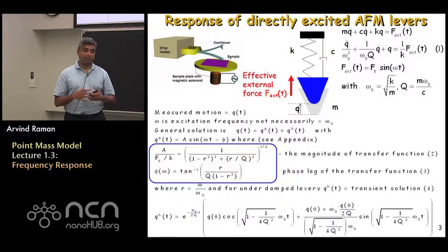And we know what we might expect, that for unit magnitude of excitation force, if the excitation force is slow and is a lower frequency compared to omega naught, you'll expect a certain amplitude of oscillation. On the other hand, if the excitation force is at frequency omega naught, this magnitude becomes larger. So it kind of refers to, if you will, a ratio of output to input of this oscillator. Output measuring the amplitude, input in some sense measuring a measure of the force applied to the oscillator, which in this case is F naught divided by K.